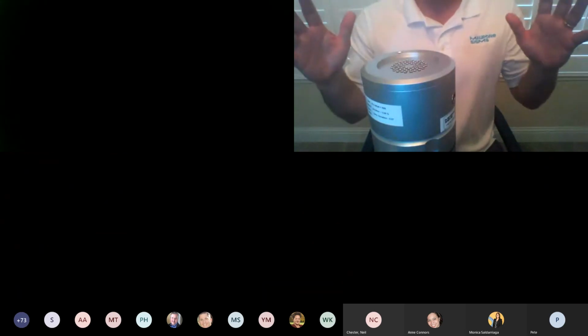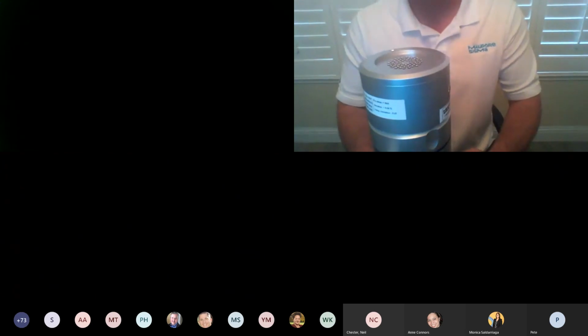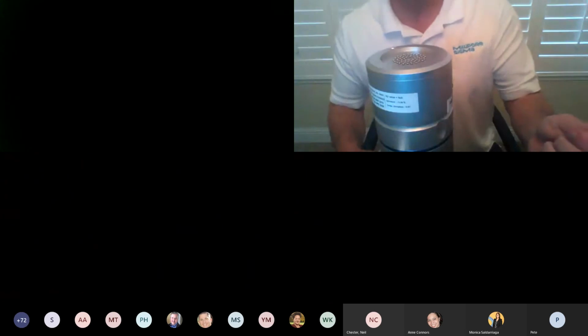If you see interference, Amber, if it's varying wildly and you feel like there's air currents and it's not still, you're probably in a spot that has air currents interrupting your flow. But generally that's not the case. Some people do it in a kind of plastic hood to control it so there's no airflow at all, and that's fine. I just calibrated it here in my house and didn't have any issues. It's not like you need to have this, because it's air. We're plus or minus 2.5%. We're not going down like a balance to 0.01 grams or anything like that.